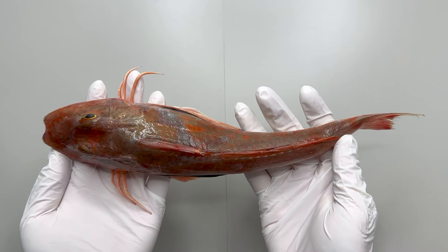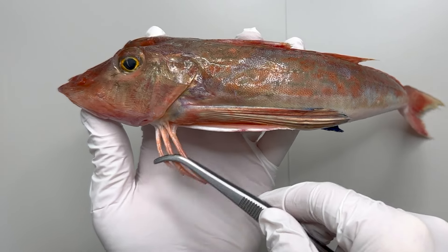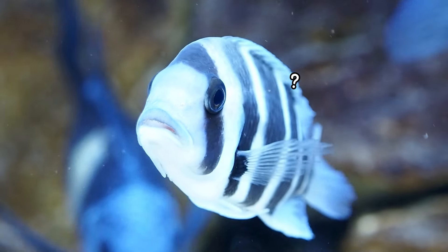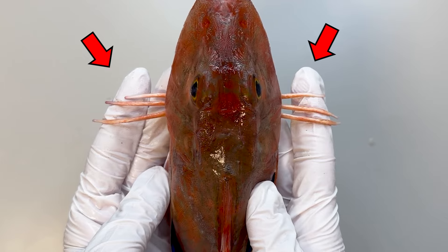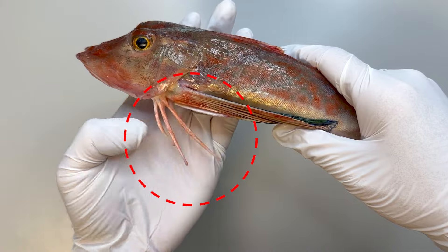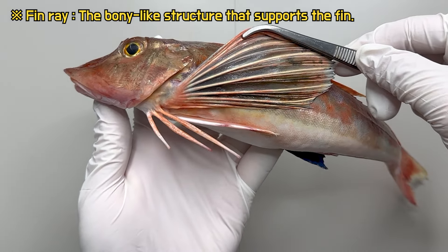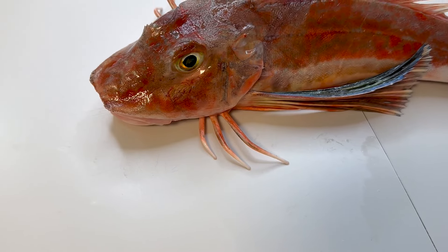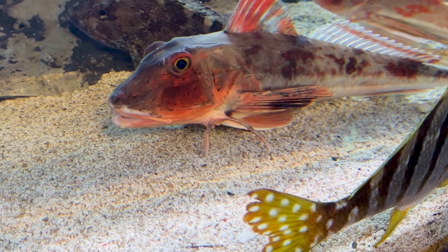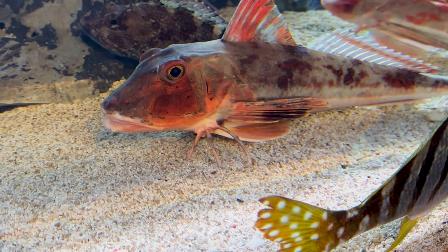We have prepared a gurnard. Upon close inspection of their body, the three pairs of legs are the most distinctive feature. Fish do not possess separate legs in addition to fins, so what exactly are these structures? In reality, these are not actual legs but are modified parts of fins. Looking behind the pectoral fin, there are bone-like structures known as fin rays. In gurnard, three of these are separated to resemble the appearance of legs. This region also functions as a sensory organ, playing a role in detecting prey hidden within the seabed. Fascinating, isn't it?